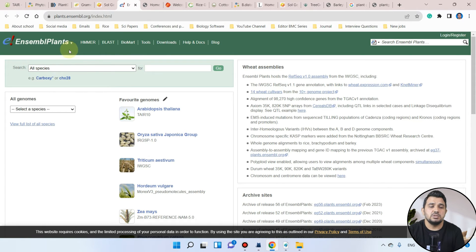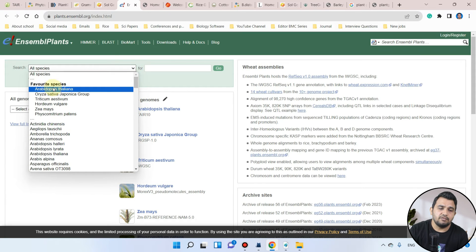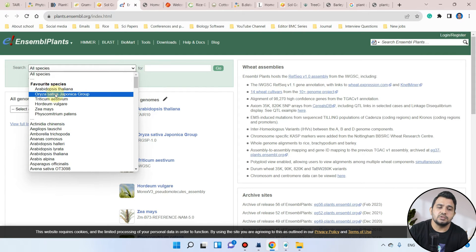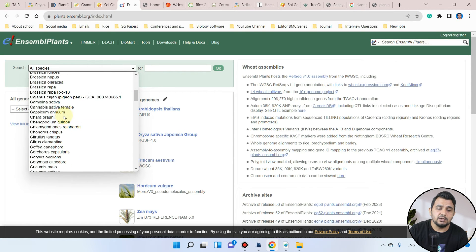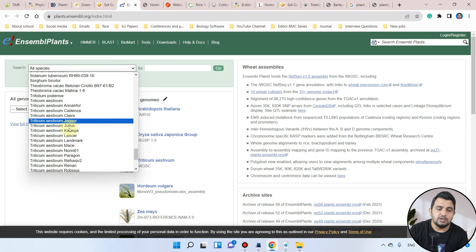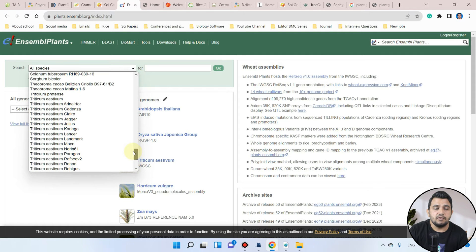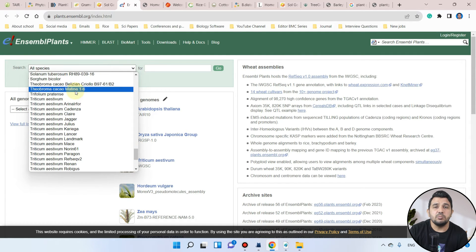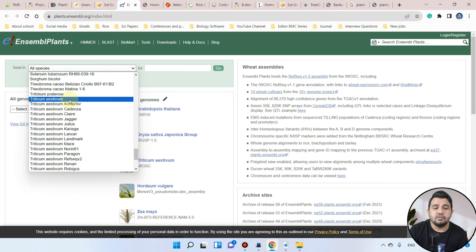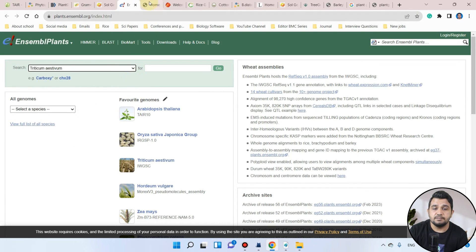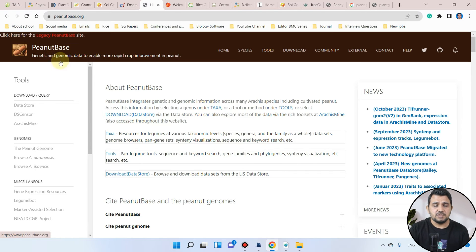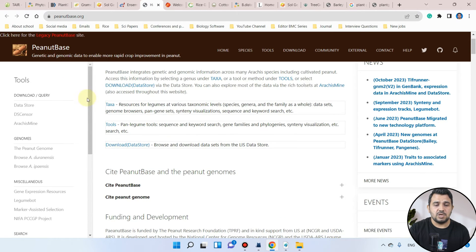The next is Ensembl Plants, which has a large list of species. Among the favorites are Arabidopsis, rice, Triticum aestivum, barley, and maize. You can select according to your purpose — for example, if you are searching a protein family in Triticum aestivum, you will use Triticum aestivum with the BLAST function. Here is also the Peanut Base, which belongs to the oilseed family.